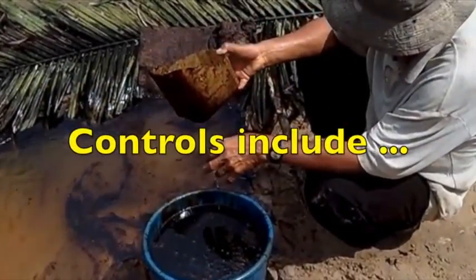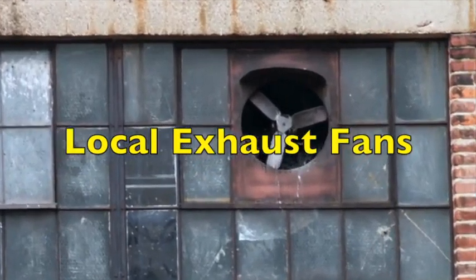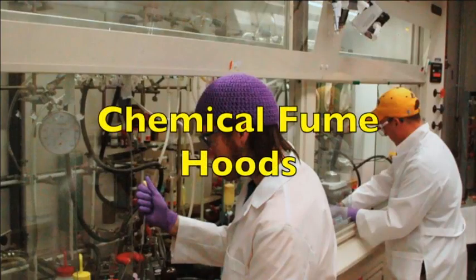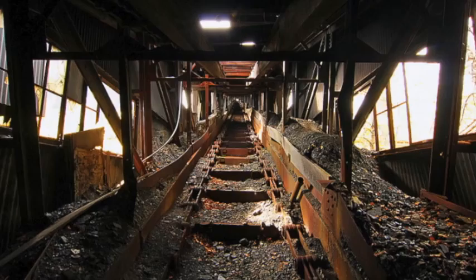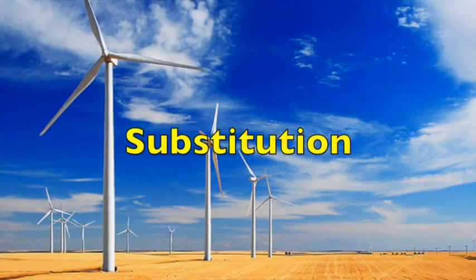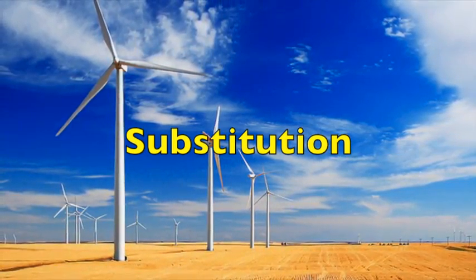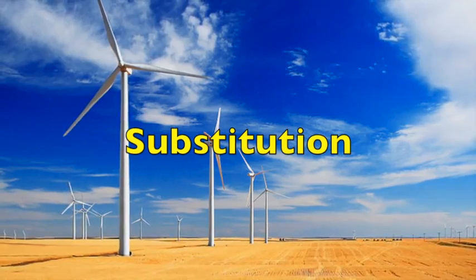Examples of these controls include opening windows or doors, or using local exhaust fans or chemical fume hoods. Substitution of currently used materials with less hazardous materials is one of the most effective ways of eliminating or reducing exposure to materials that are toxic or pose other hazards.